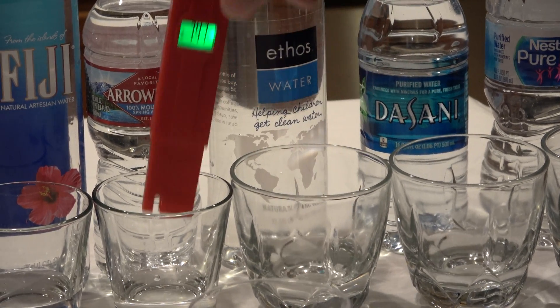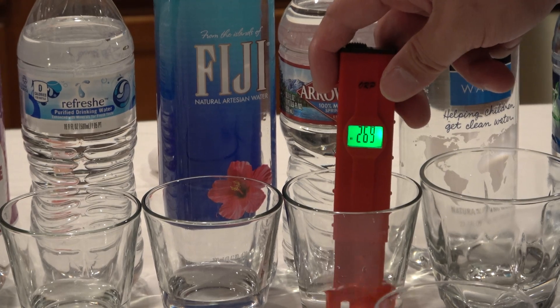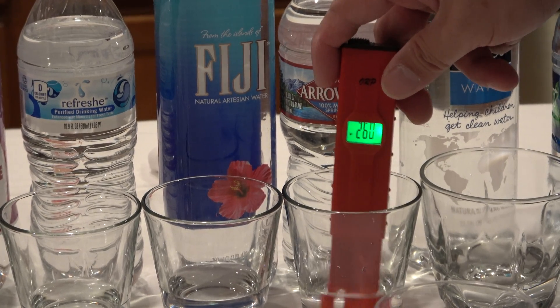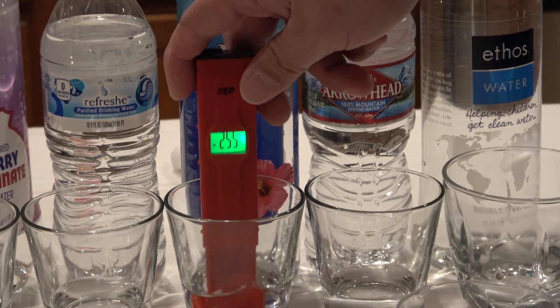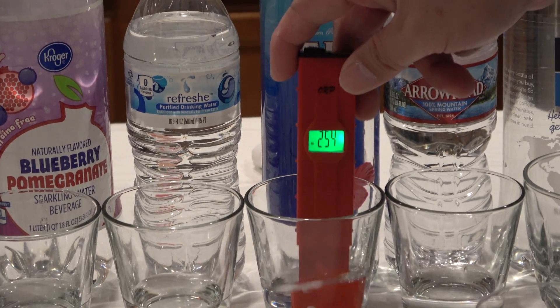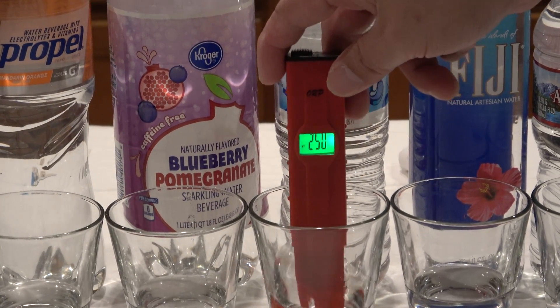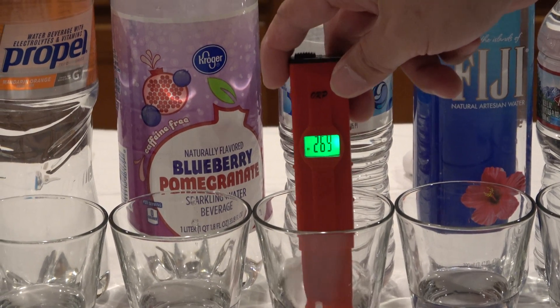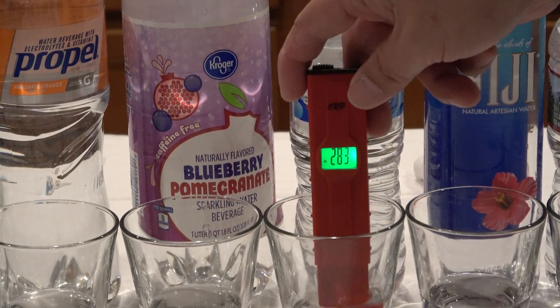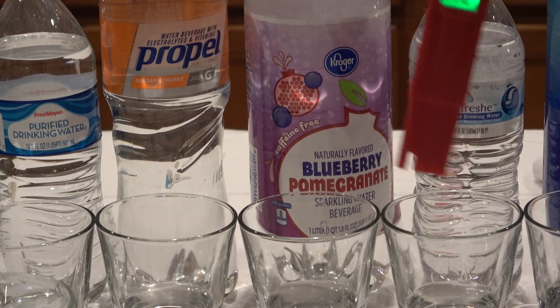The Arrowhead is about positive 260 something. The Fiji water is about positive 254. The Refresh is about 275 and climbing, 280 and climbing.